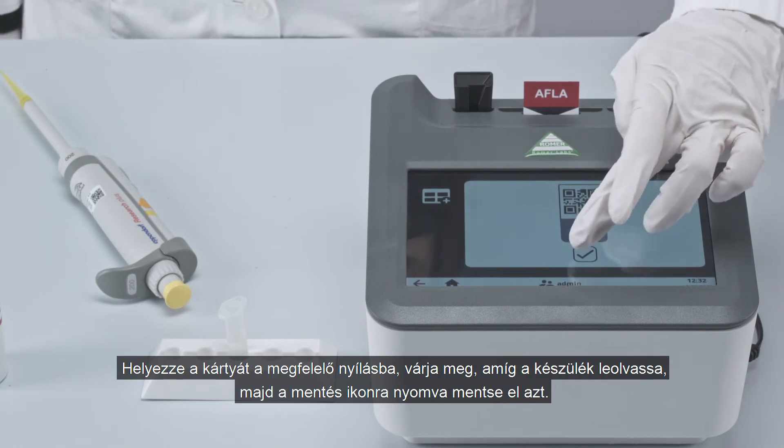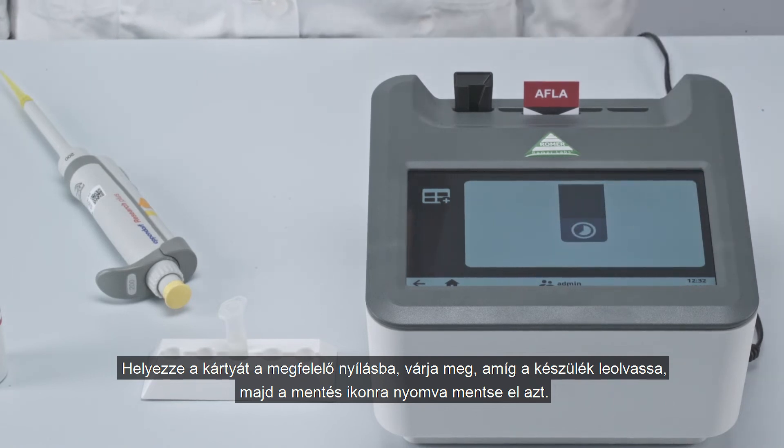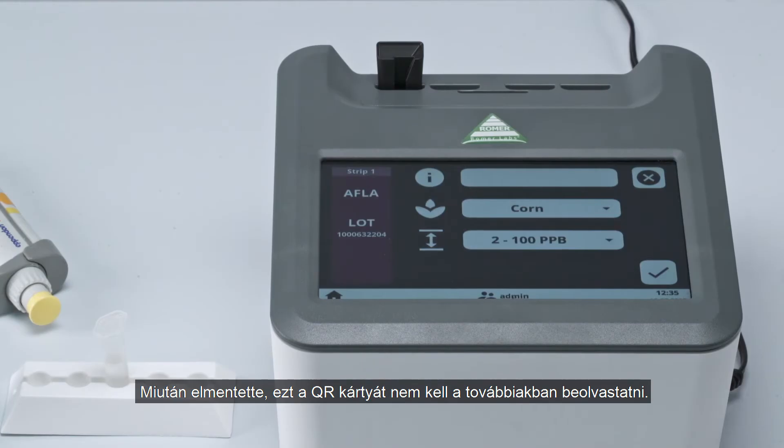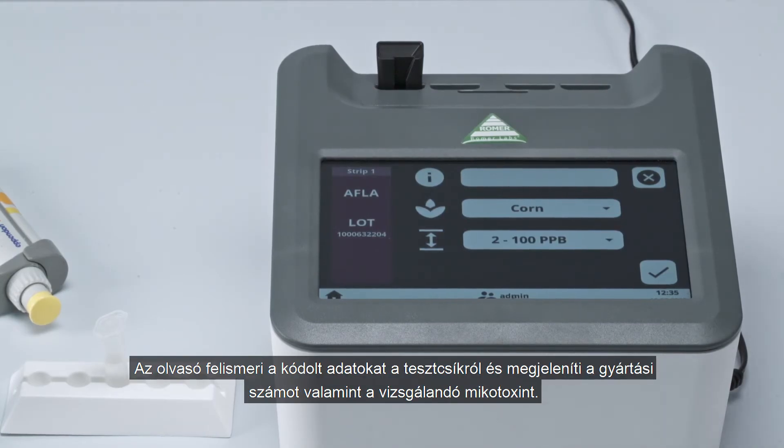Allow the reader to read it and save it by tapping the save icon. Once saved, this specific QR code won't need to be scanned again. The reader recognizes the data matrix code on the test strip and displays both its lot ID and the analyte.